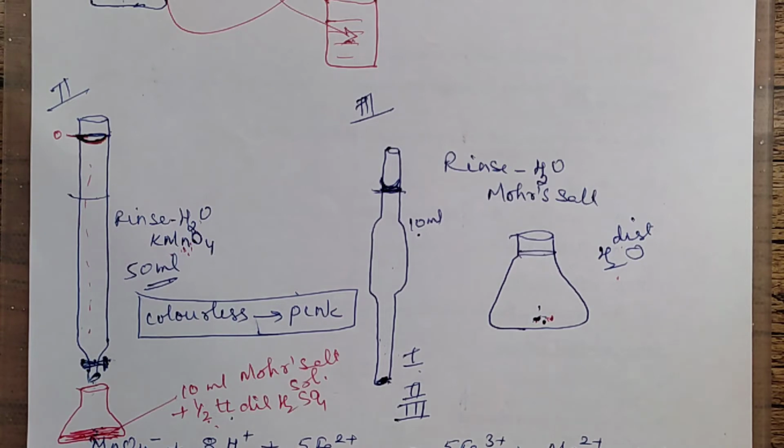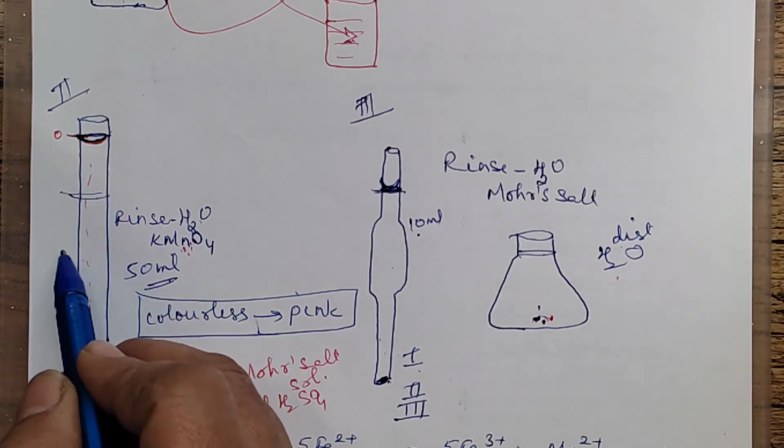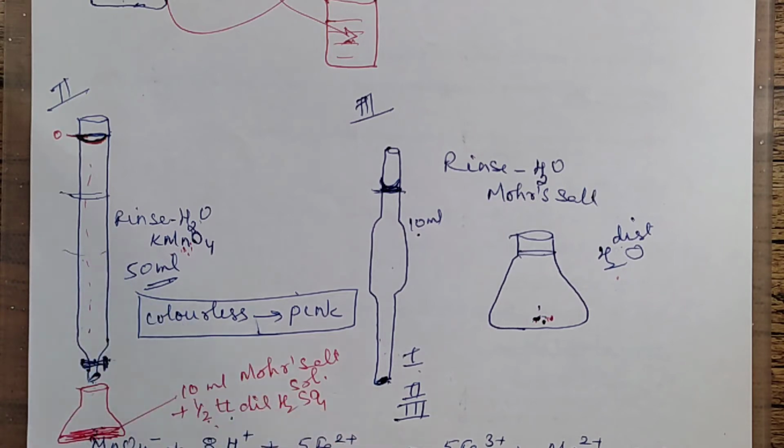Not necessarily exactly 3 times, because you will have to go on performing the titration till you get 2 consecutive readings the same. Every time when you note the reading, you can take this now as the initial and continue the titration. You can take the next one here and so on. Every time the conical flask is to be rinsed only with tap water and distilled water.